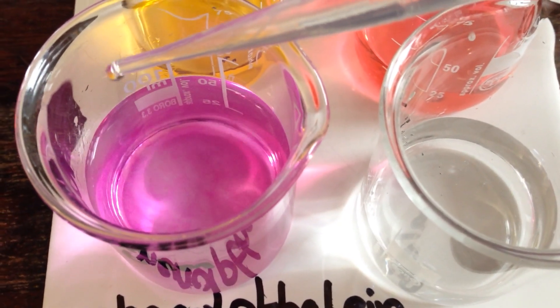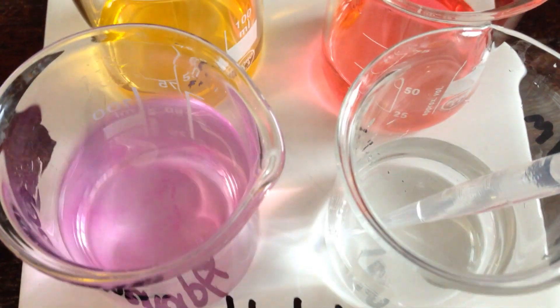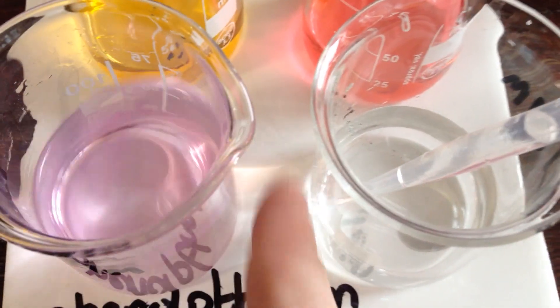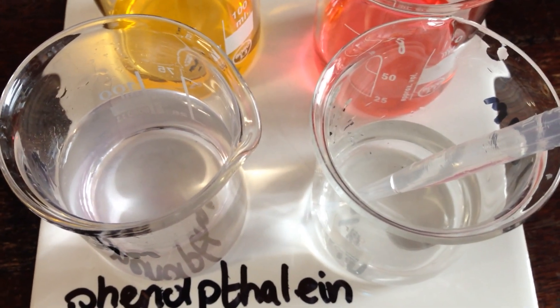Hopefully here you can start to see it's changing color. Give it a swirl. You can see it's still a bit pink. Swirl more and you can see it's permanently changed color. This is why swirling is really important.